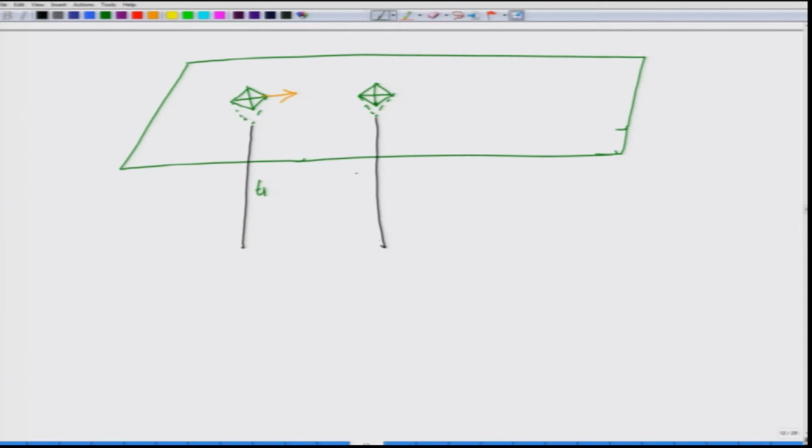And then this is at T2, and then let us say you apply the stress for some more time, and then you may see this over here. What is interesting is that you can even see the remnants of the earlier dislocation, because it is getting etched and the dislocation at the bottom has vanished.